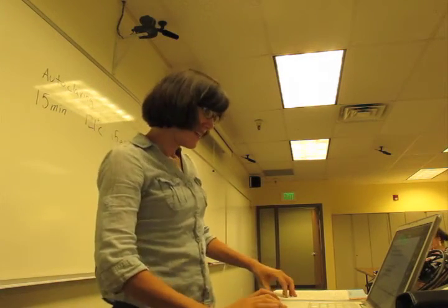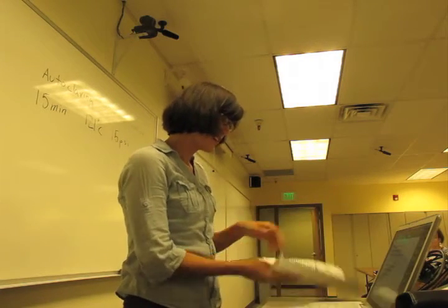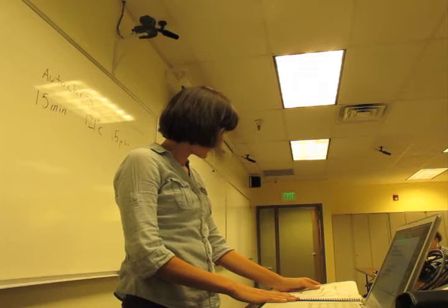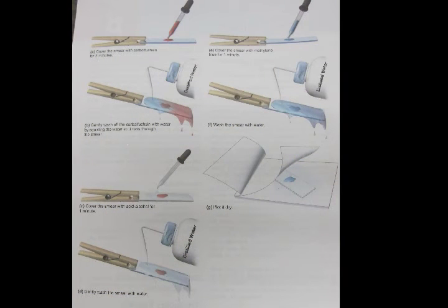Okay, let's go over the steps of the acid-fast staining. It's not as long as the gram staining. The first one we start out with is carbol fuchsin, which is red. That sits on there for 5 minutes, and then the decolorizer that we use for acid-fast staining is, anybody know?